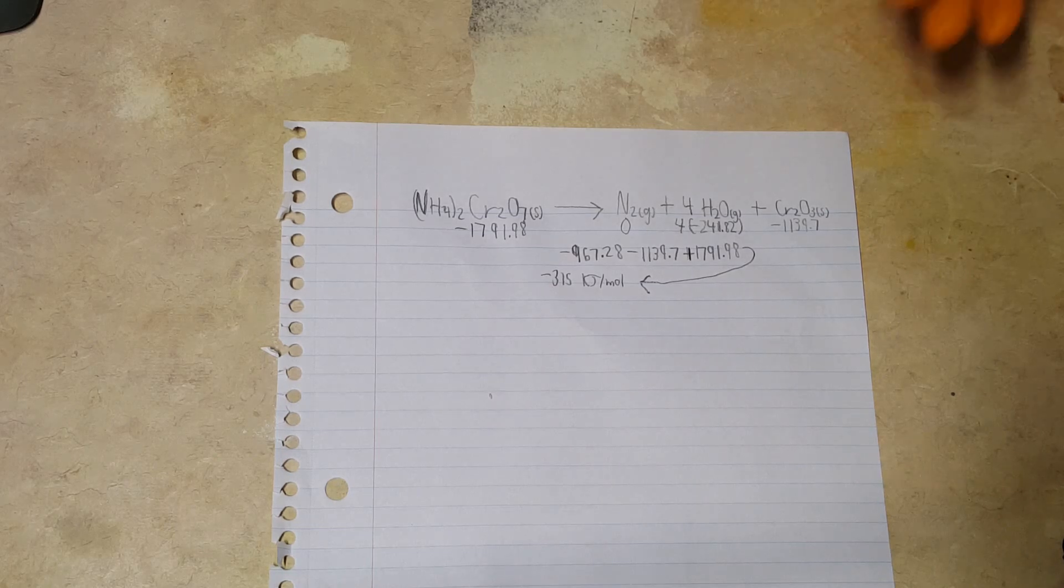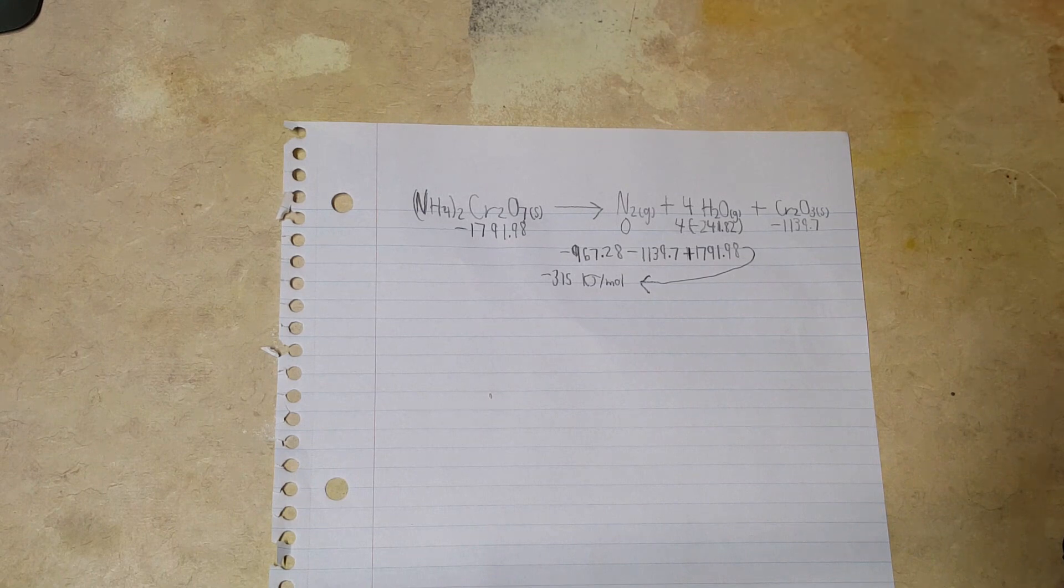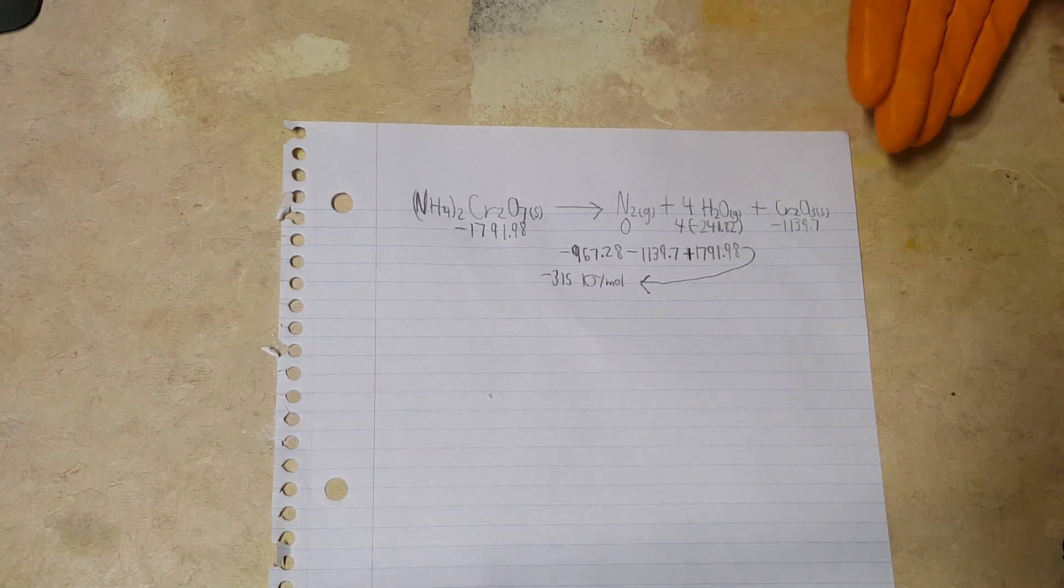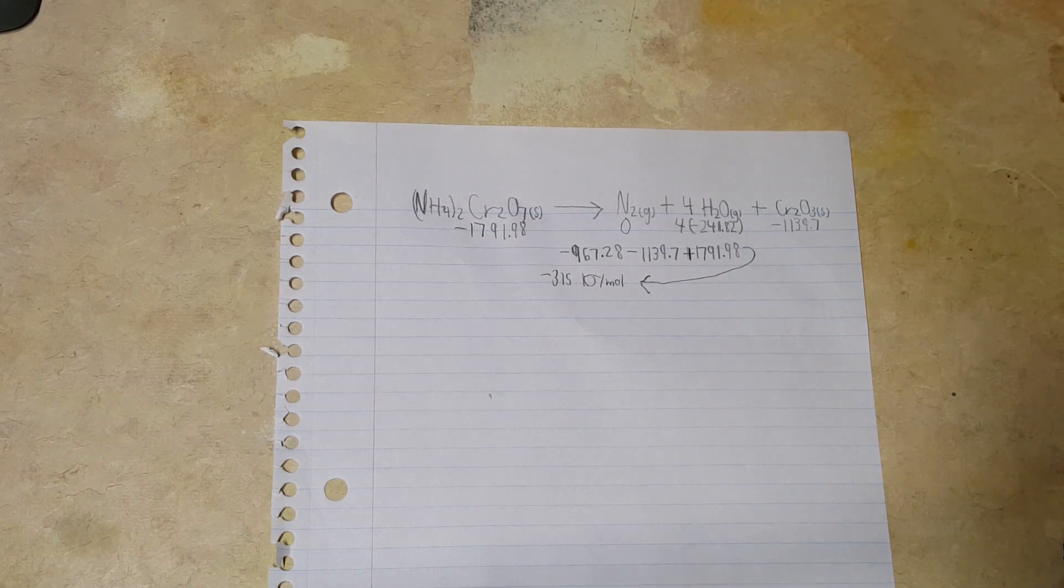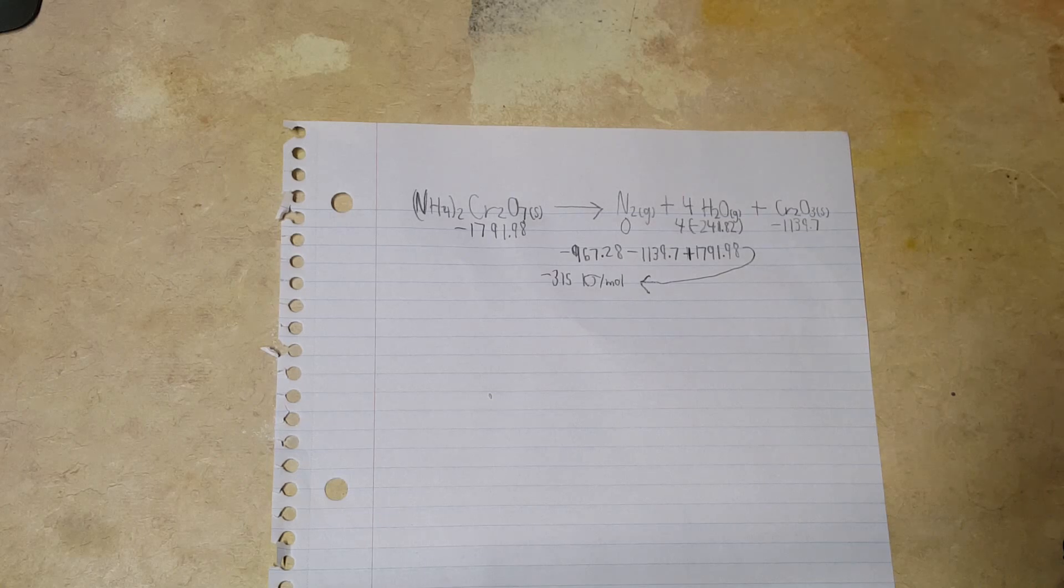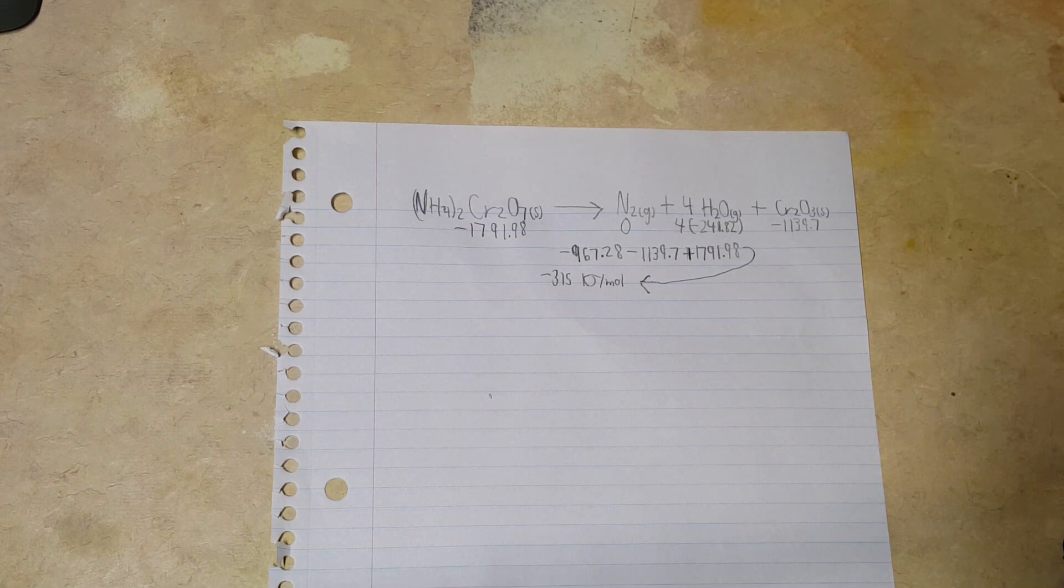The nitrogen and water vapor are going to create gas pressure to throw red hot green chromium oxide out over the top of the reaction. This far less dense green chromium oxide is going to build a bit of a cone around the reaction. I often like to call this the Vesuvian fire reaction.